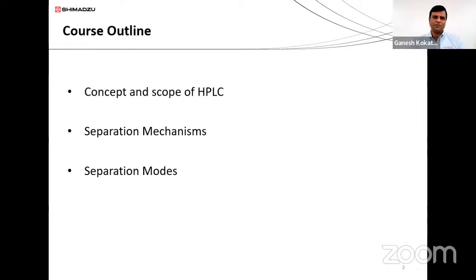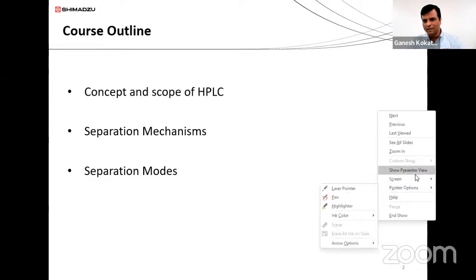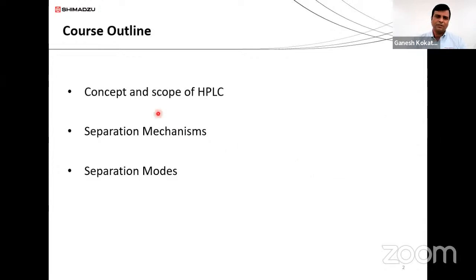It's free to ask. Today I'm going to cover the concept and scope of the HPLC. Apart from that, how the separation takes place, what the actual mechanism of separation is, and what the different modes of separation are.